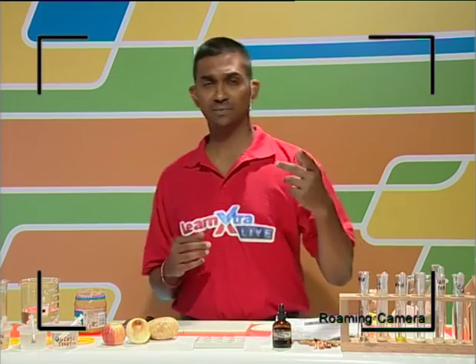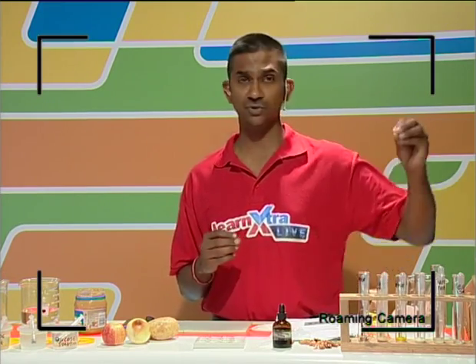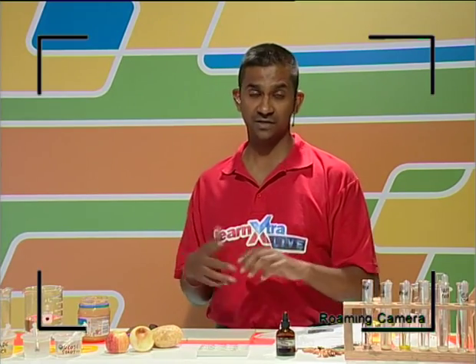Now, starch, guys, just to remind you, is a complex carbohydrate, and it's not like glucose, which is a simple carbohydrate, a monosaccharide. So hence, we cannot use the same reagent that we used when testing for the presence of glucose to test for the presence of starch in food samples.